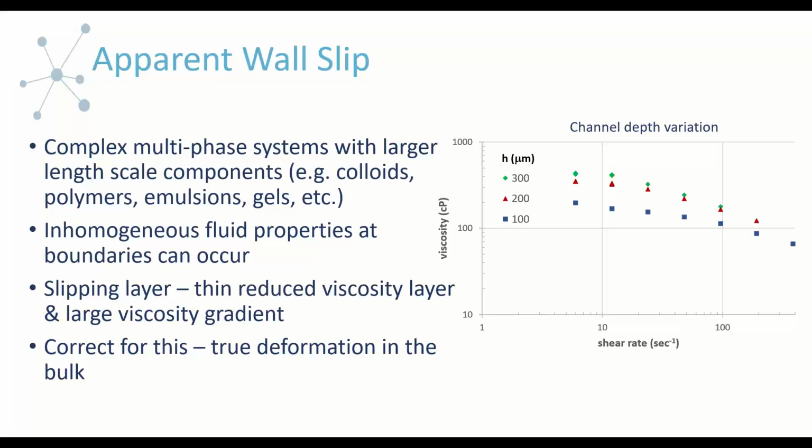But with a lot of the other types of capillary viscometers, you would have to do that particular correction, and you'd want to do that before you try to handle the wall slip. So when you're doing certain corrections, you need to do them in a particular order. But in our system, you don't have to worry about that. I just wanted to point that out in case someone does work with those.